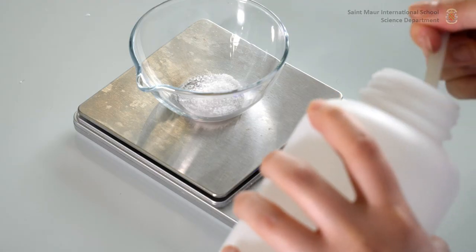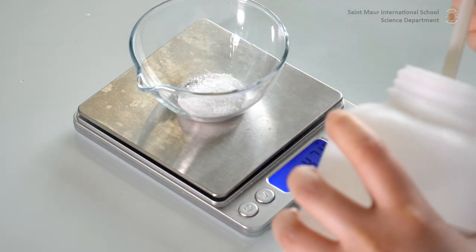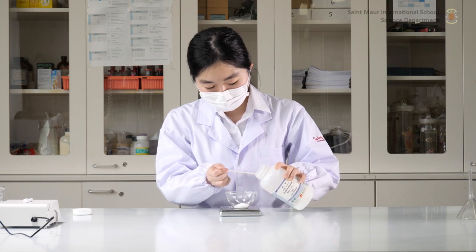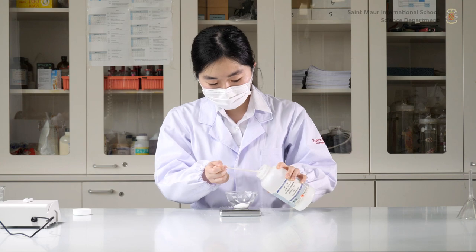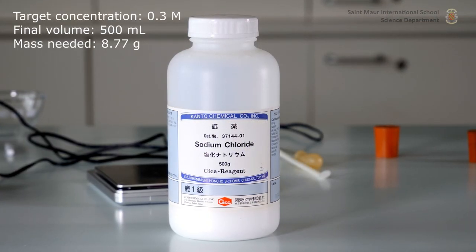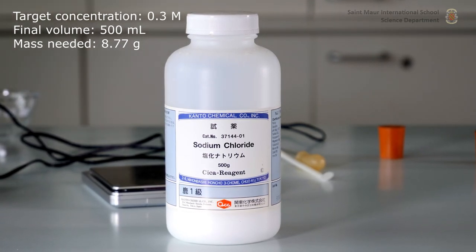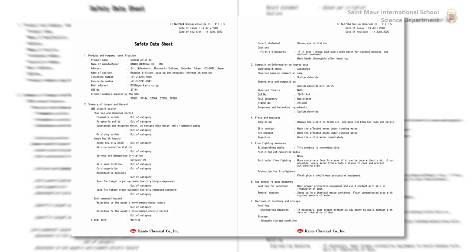Use a spatula to scoop the solute from the stock container. The solute is the substance to be dissolved in the solution, and the solvent is the substance in which the solute is dissolved. In this demonstration, the solute is sodium chloride and the solvent is water, neither of which require particular protective gear. When preparing any other solution, consult the relevant material safety data sheets and use appropriate protective equipment.